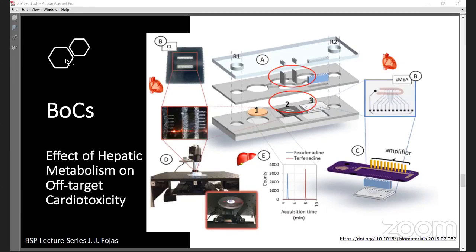So you can see the MEA there with the amplifier, the right side image. So this is a schematic of the microfluidic platform and interface used to measure the functional activity. And then you have here the two laser-cut acrylic layers, housing two layers of cut PDMS gaskets that define your microfluidic flow pathway and the compartments for each chip. So you have that in A.